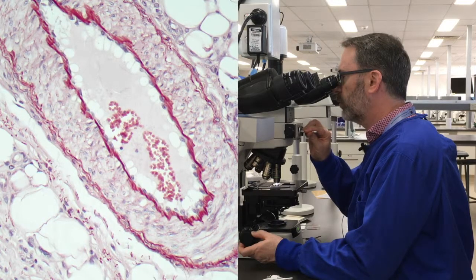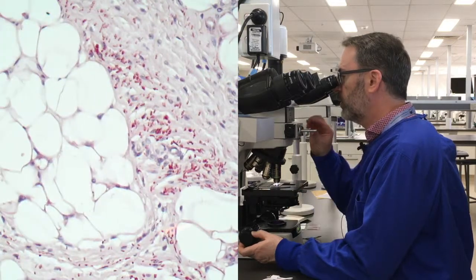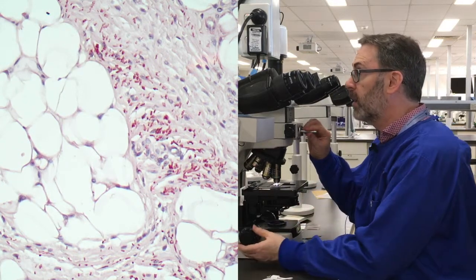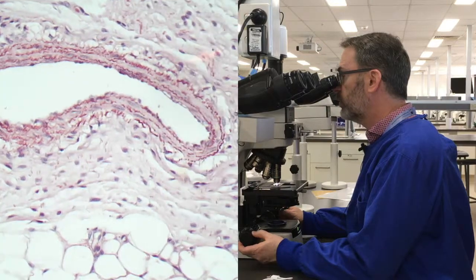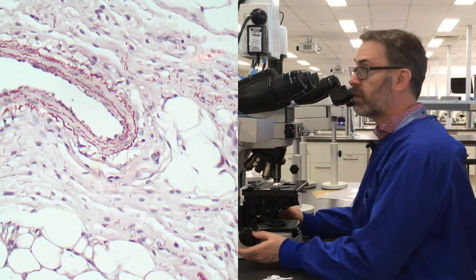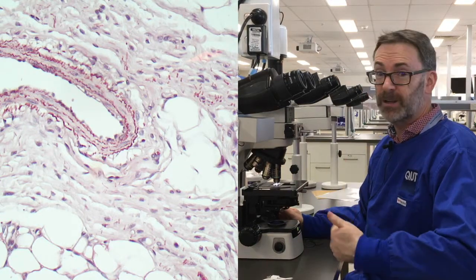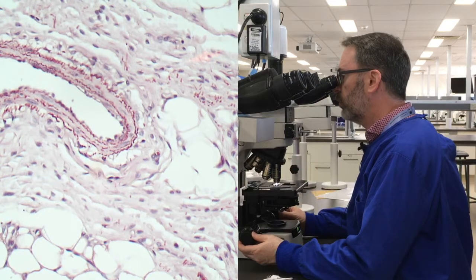The internal elastic lamina is well demonstrated, as well as some finer elastin fibers further out. Within the connective tissue here as well, we've got that nice contrast with that brick red color. And in terms of the nuclear counterstain, this was the Mayer's — this was actually the one that was left on for a bit longer, so it had about 20 plus another 15 minutes or so. And that actually looks pretty good.